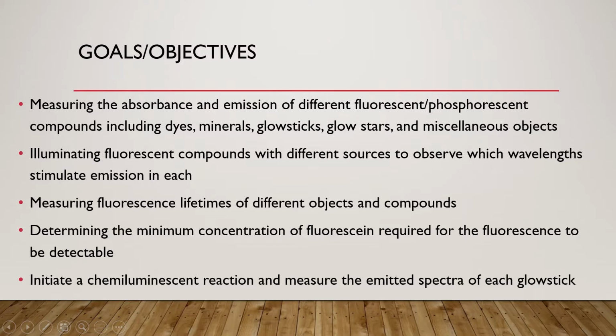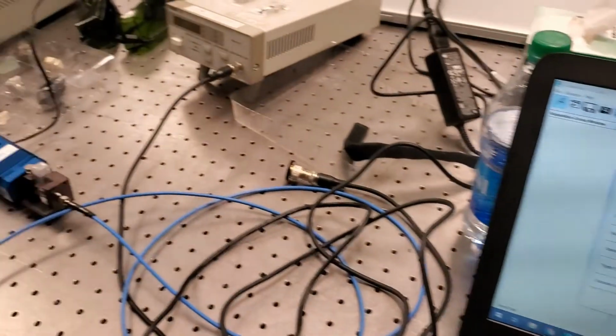Measuring fluorescence lifetimes of different objects and compounds. Determining the minimum concentration of fluorescein required for fluorescence to be detectable, and initiating chemiluminescent processes.